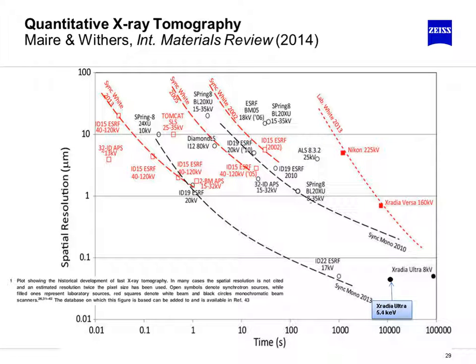As I've mentioned, X-ray tomography is for us a really fascinating and powerful tool because it's a non-destructive tool. And this means that we can characterize the same microstructure or the same device at different stages within its life cycle. And we can also look at failure and degradation mechanisms that occur over different timescales. We've already talked quite a lot about the different length scales that might be associated with lithium-ion battery research, but it's also important to think about the different timescales.